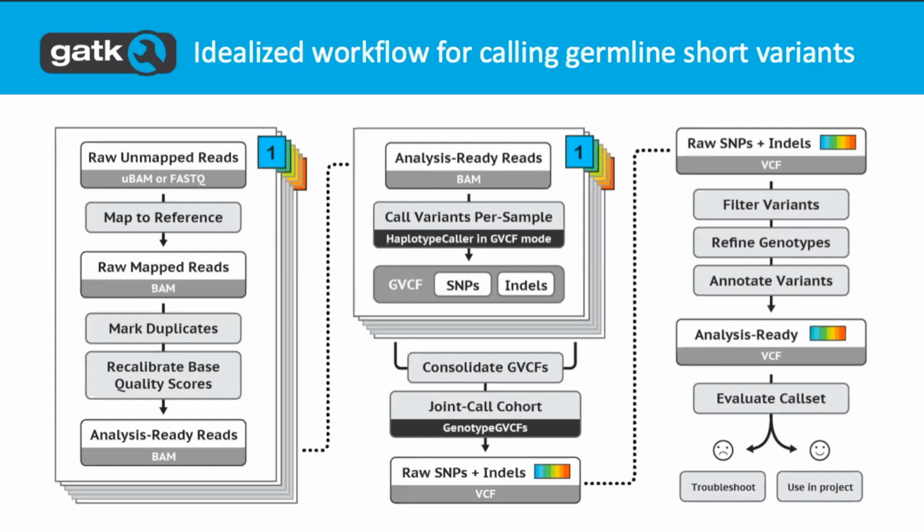I know that Sam's tested it on whole genome, exome, somatic, and germline, and it's all worked really well. That's what we're going to add to our best practices as well. On more than a single sample, it is technically feasible. It's just not validated as being the way to do it. Right, that's what I thought.